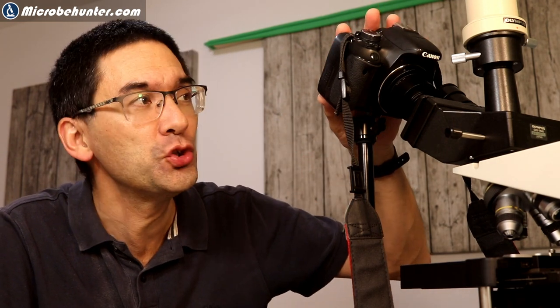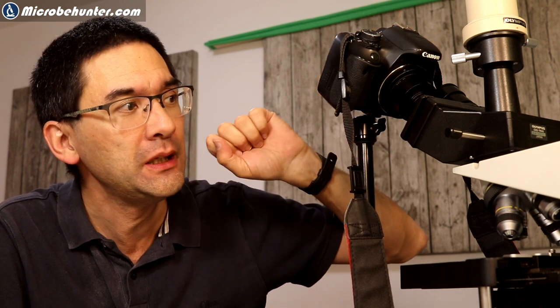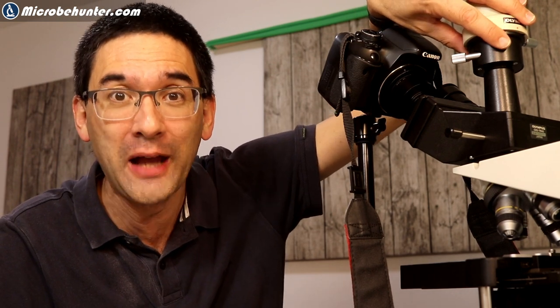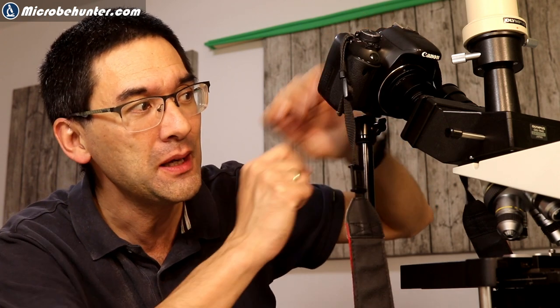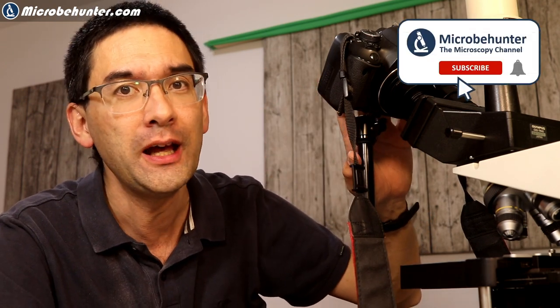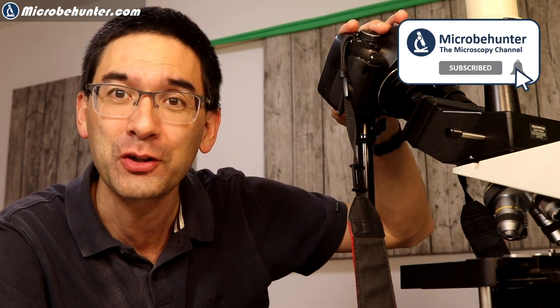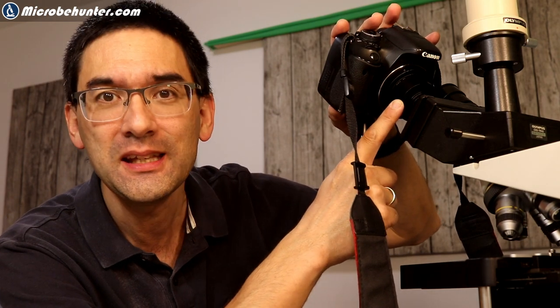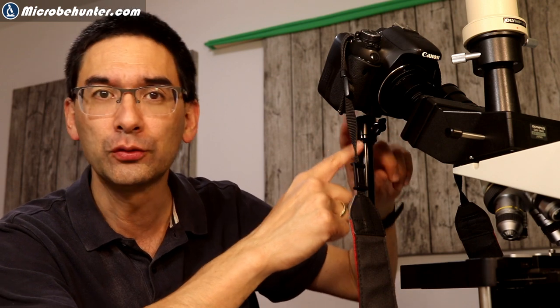Hi, MicroPunter here. Today I want to talk about stability issues when you connect a DSLR camera to a microscope. Sometimes people don't have a photo tube — normally you would connect the camera to the trinocular photo tube. Some microscopes don't have it, and it's still possible to connect a DSLR over the eyepiece. However, there are challenges, especially if your microscope is not very large — it might actually tip over if the camera and adapter are too heavy. In that case, I recommend using a microphone stand.